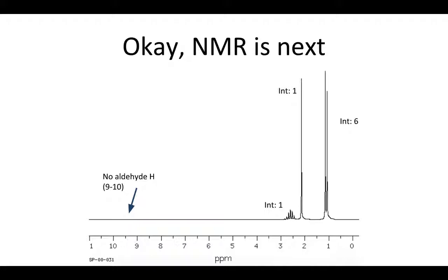And these are all in your follow-along document if you want to follow along with your own paper. So we take a look at the NMR spectrum, and we see 3 different signals. One here, one here, one here. But what I don't see is an aldehyde signal.